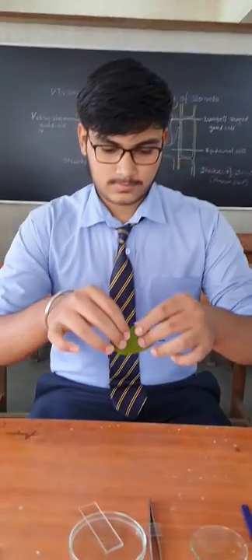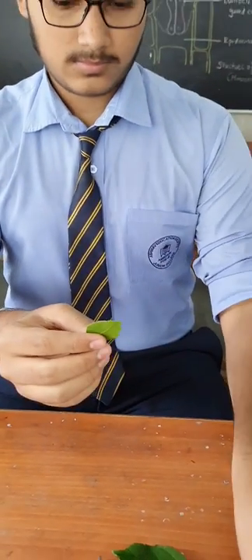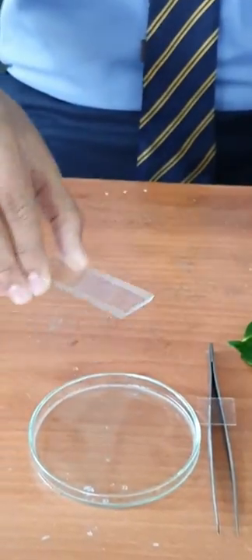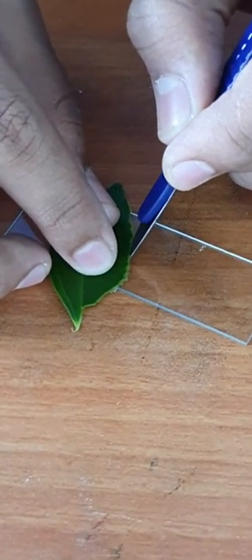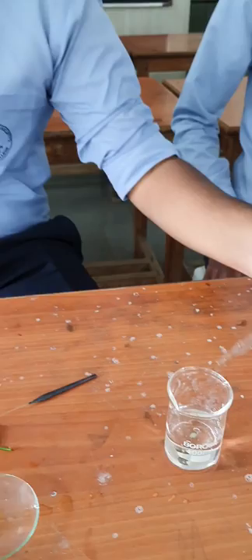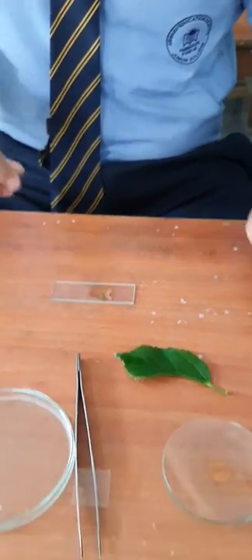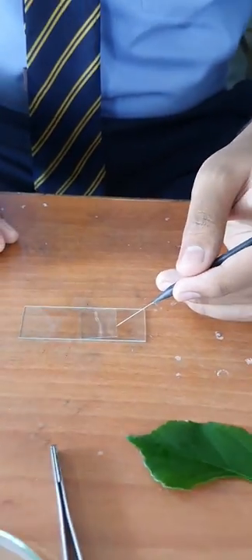Now take a hibiscus leaf. Hibiscus is a dicot plant. Peel off this leaf as shown here. You can observe the transparent layer which is pointed by the needle. Take the part of it on the slide and cut it into small sections using a blade. Add a drop of water over it. You may also use glycerin instead of water. Now put a cover slip properly and your slide is ready to observe under the microscope. First observe the slide under 10x and afterward observe under 45x.